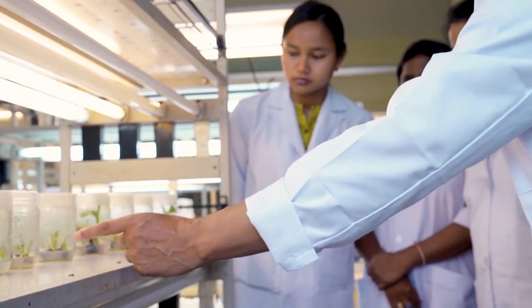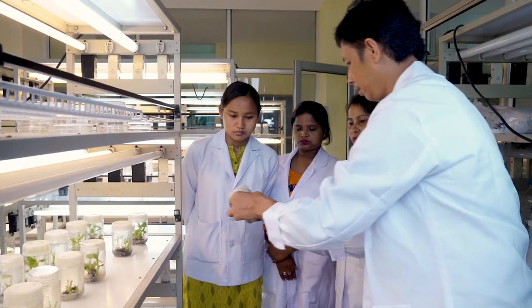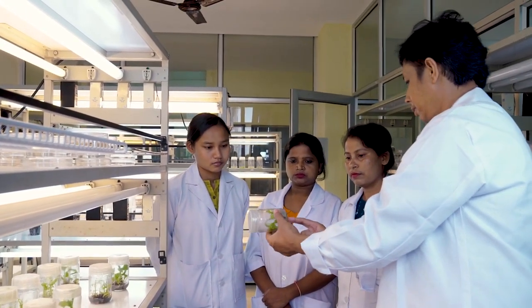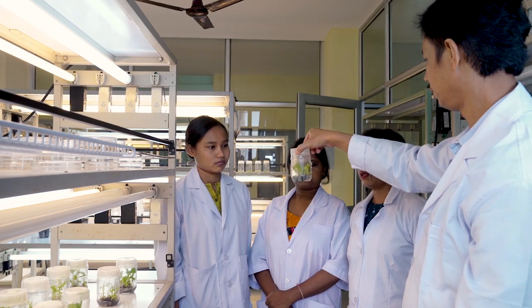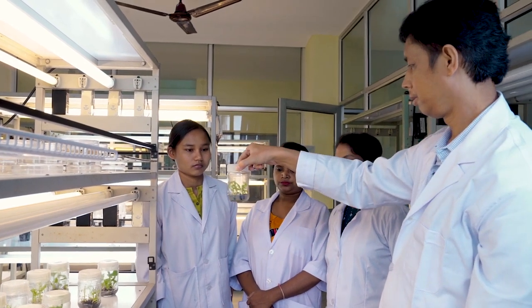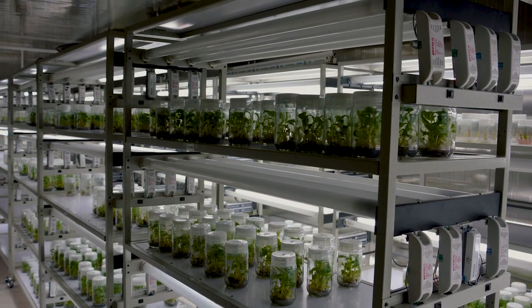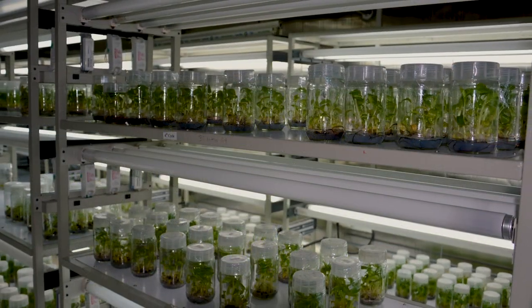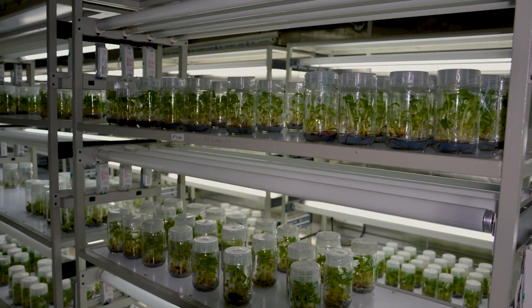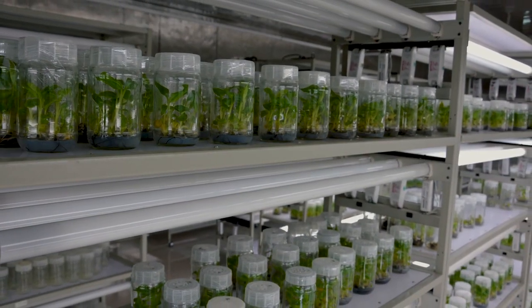Once we have inoculated the microplants into the culture jars, these culture jars are to be maintained in the culture room at a temperature of 24 degrees centigrade and in 16-hour light and 8 hours dark. After 24 to 30 days, we need to do the next subculture. We will have to check for contamination in the cultures. In general, fungal contamination appears within a week.